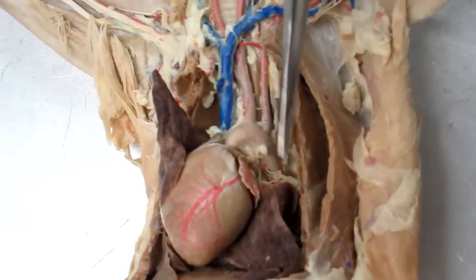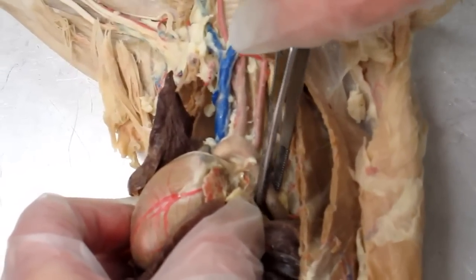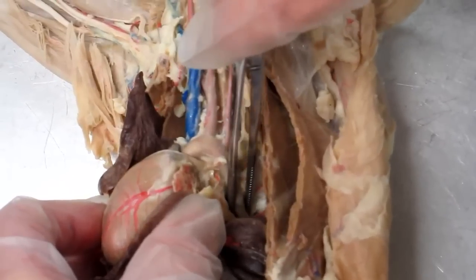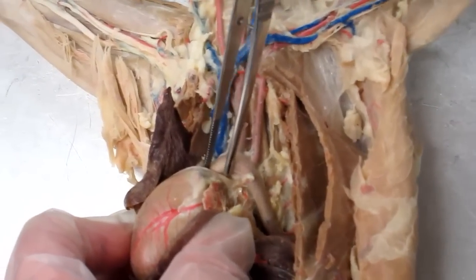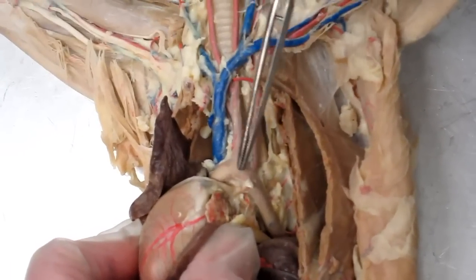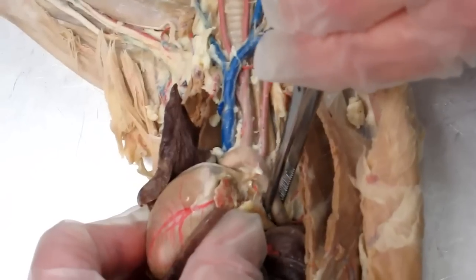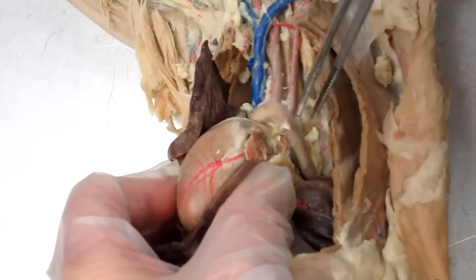And then we'll move some of the lung material out of the way, and we can see the descending aorta here, and we could more specifically say that this is the thoracic section of the aorta as well. So remember the candy cane, with the ascending being the short part of the candy cane, the arch being the curved part of the candy cane, and the descending portion being the long part of the candy cane.